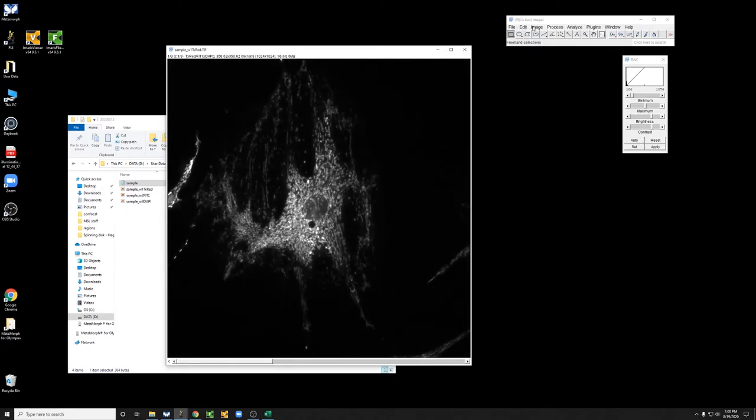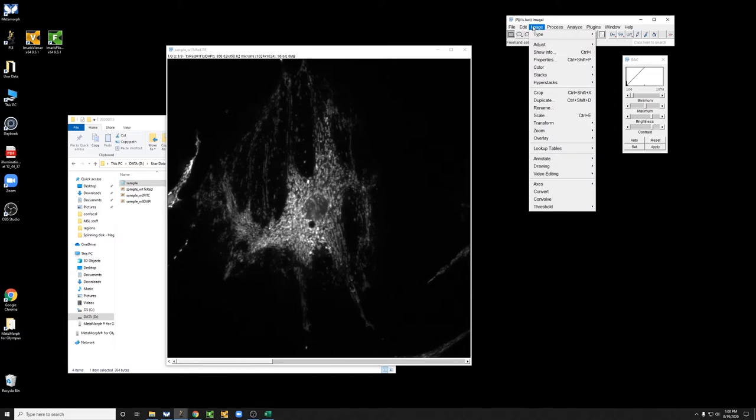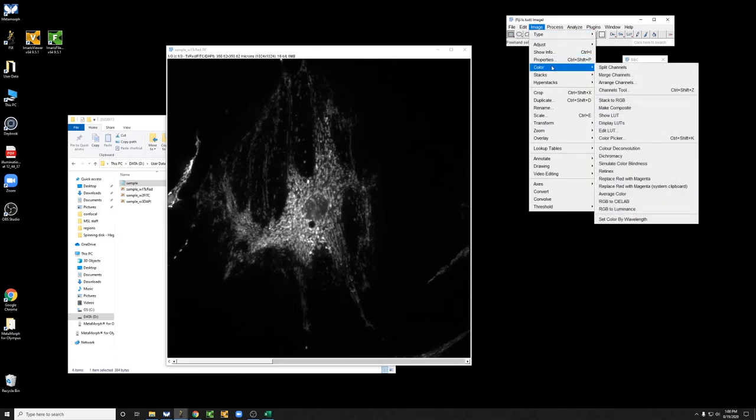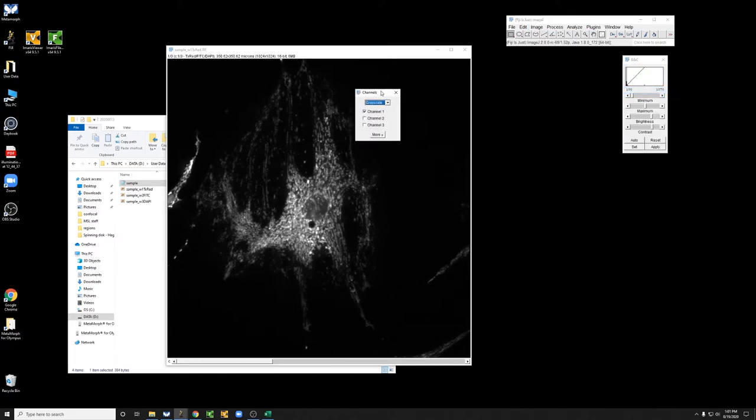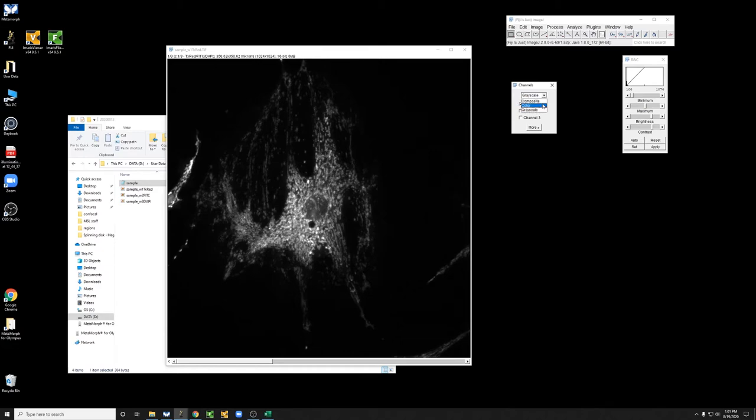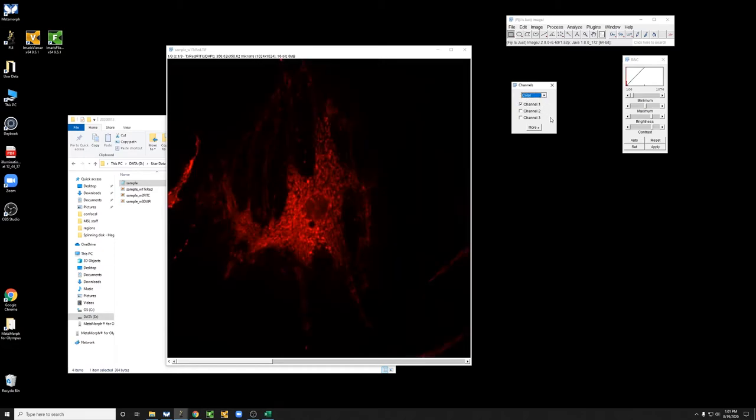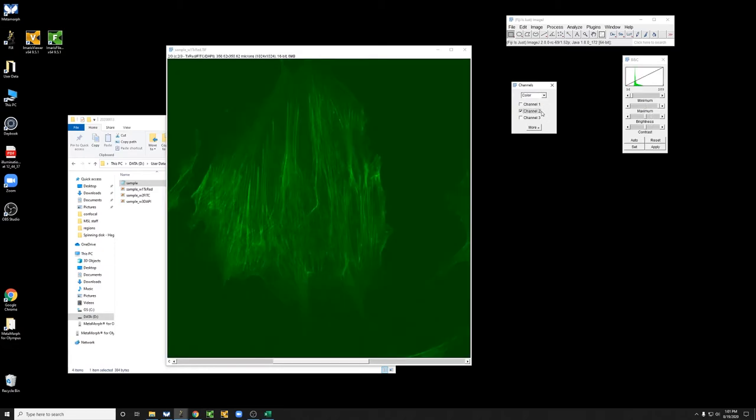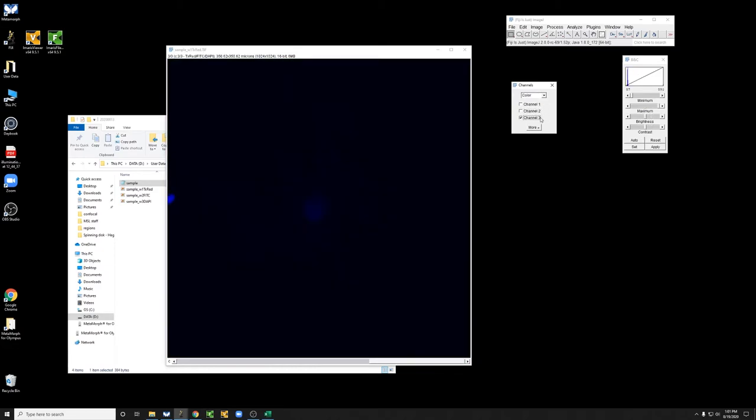And if you go to Image, Color, Channels Tool, you can look at the channels with different colors. You can change those colors if you wish, and you can look at a composite.